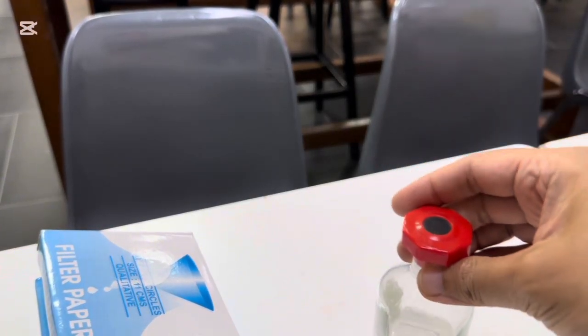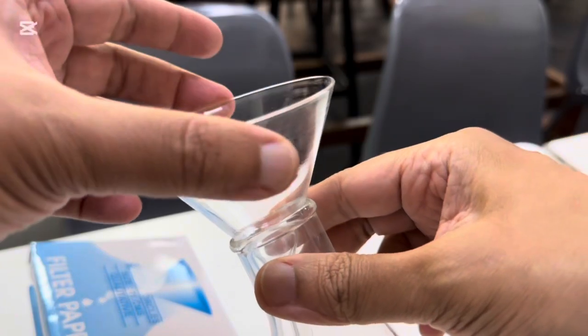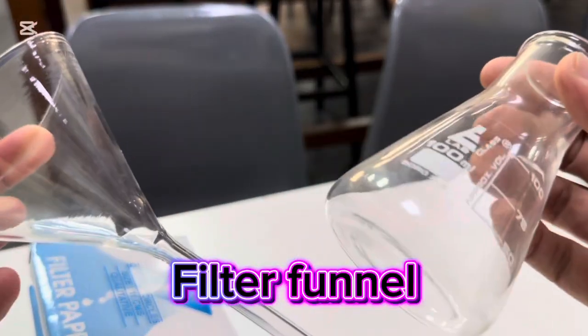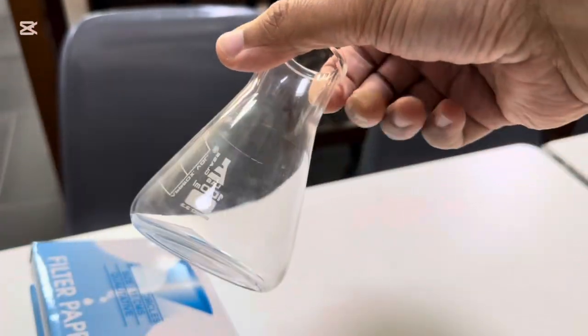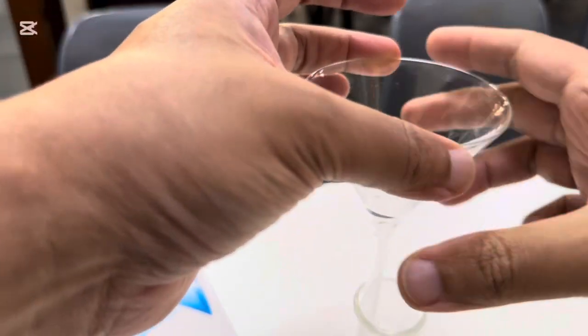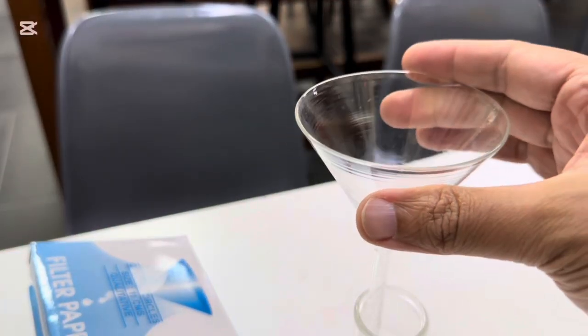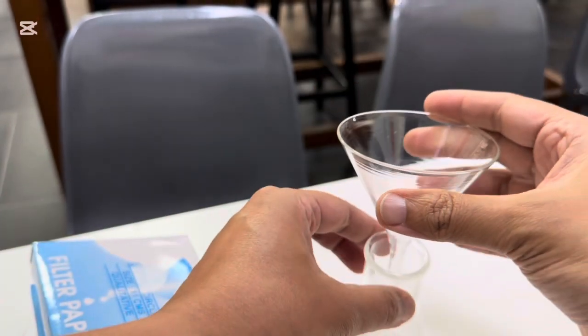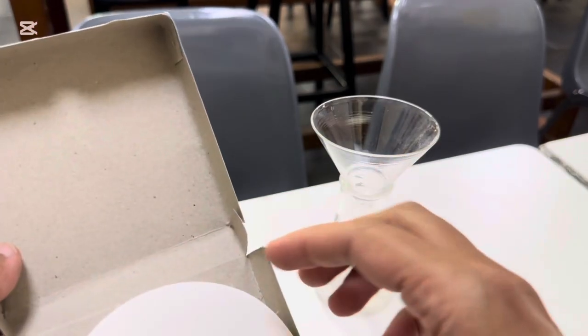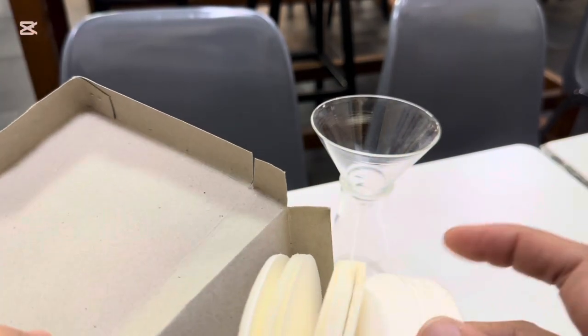Filtering can also be used to separate lots of things like sand and water. The apparatus for filtration is pretty simple. It usually consists of a glass vessel called a filter funnel, and also a suitable container. This is a conical flask, but sometimes you could also get away with a beaker, so long as you hold the filter funnel. I'm just using a conical flask in this demonstration because I want to keep my hands quite free.